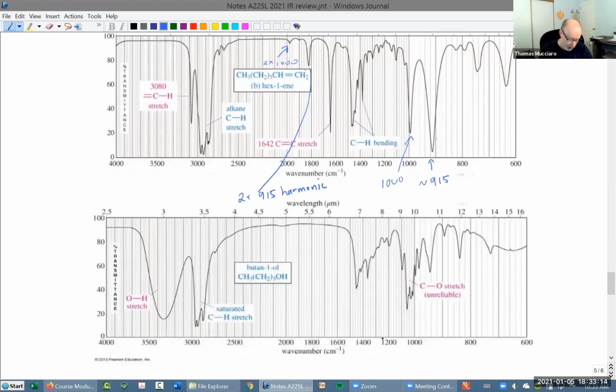All right. I want to show you, this is an OH. Most OHs of alcohols, I'm going to just make that distinction, OHs of alcohols, they come right around 3,300 or so. It's a little bit above it. Do you see that? Where the highest part is, just a little bit above 3,300. Okay, and they're very broad. It's a really wide peak as opposed to this peak over here, which is really narrow, right? Broad, narrow, sharp.